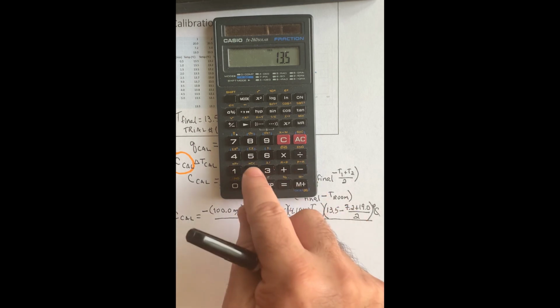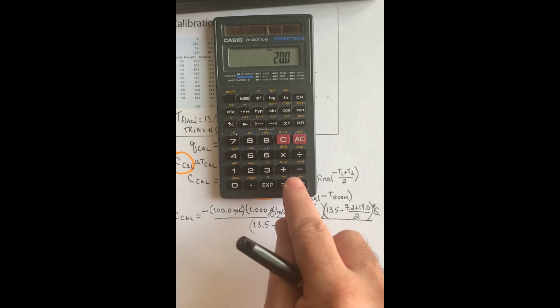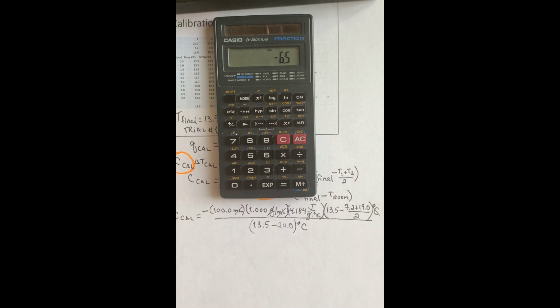13.5 minus 20. And as expected, it gives us a negative number, minus 6.5. I'm going to put that in my memory for now. And notice that that value now has two sig figs, because it includes the decimal that we expect to have in all these temperature measurements. I'm going to assume that for the most part, since everything can be read to one decimal, we'll take the two sig figs as our kind of starting point for all these calculations.